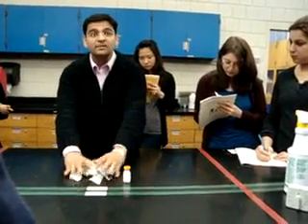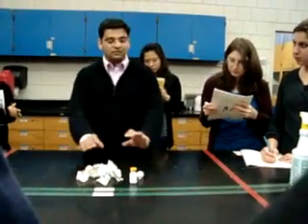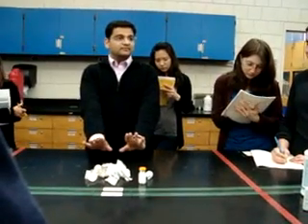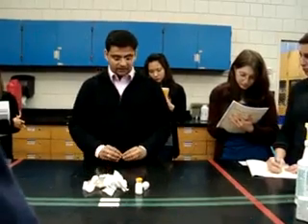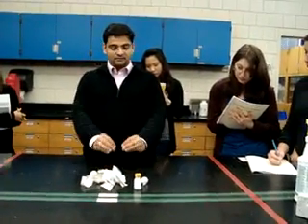Why not too much inside? Because I don't want you getting into the hood and working. You should be working this way. This is my comfortable position — I don't want to be working way inside. You should be working here, at the proper distance.